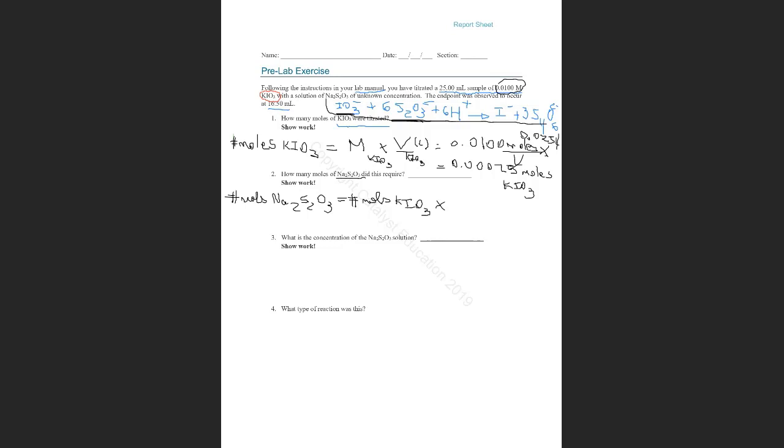I look at this part and I see that 6 moles of thiosulfate reacts with 1 mole of iodate.